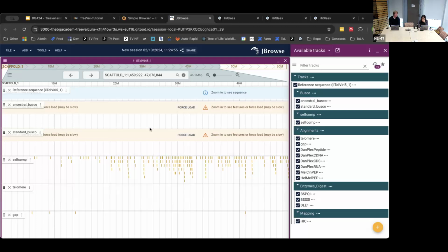That was just to demonstrate. This is a Lepidoptera that was already loaded onto the Gitpod. So the question is, do they have to wait for the Nextflow process to finish? No, the Nextflow process you're running was just to demonstrate how to run Nextflow. That's using a subsetted nematode. This is Lepidoptera data that's stored on the Gitpod for illustrative purposes, so you don't need to wait for it to complete to be able to open up JBrowse.